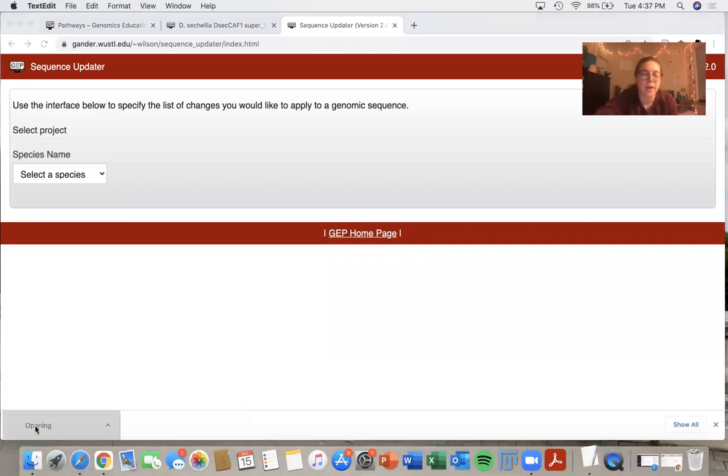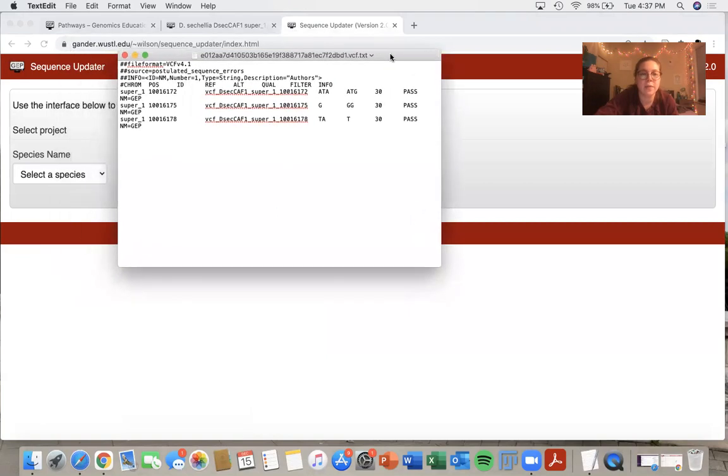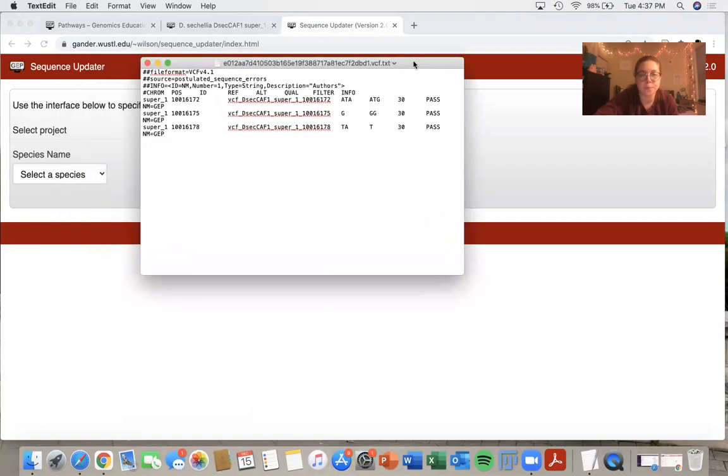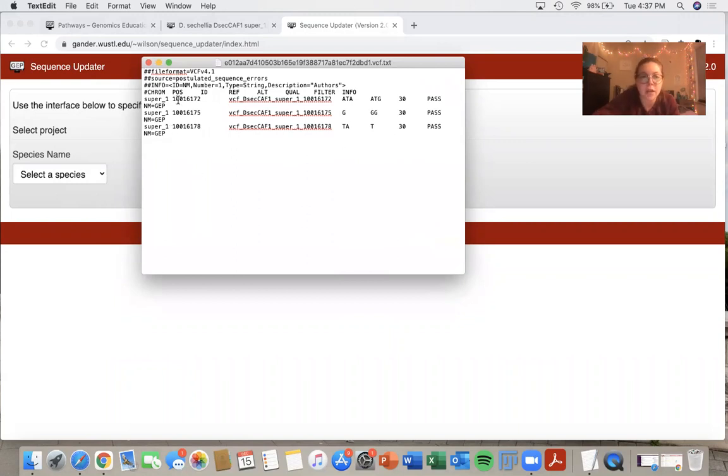So here's my VCF text file. In this file, it explains a little bit more about the changes that I had just made.